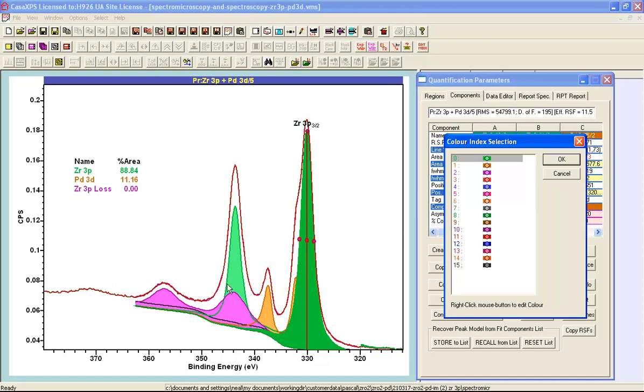In the current mode, the colour applies to the outline of a component, and then a faded colour is associated with that outline. So this is really a two-colour component, and we can see here in this palette how these two colours relate. So we've got an outline which represents the outside of this marker here, and the inner colour is marked internal to this circle.